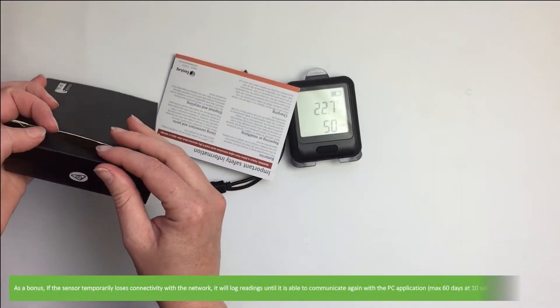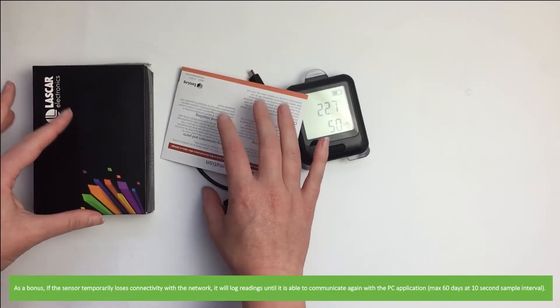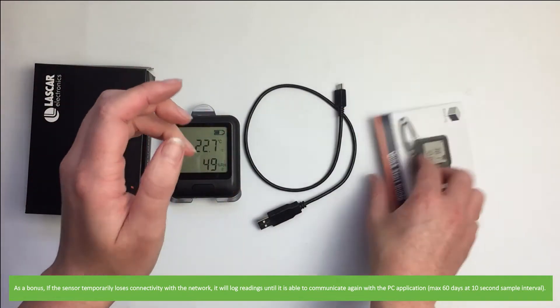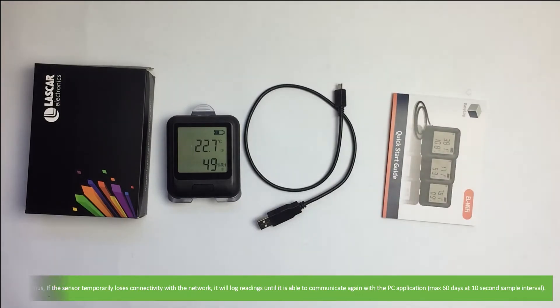As a bonus, if the sensor temporarily loses connectivity to the network, it will log readings until it is able to communicate again with the PC application. This is a maximum of 60 days at a 10 second sample interval.